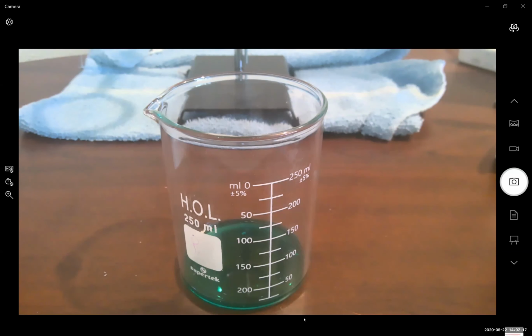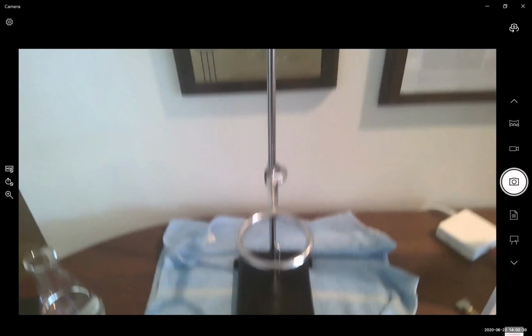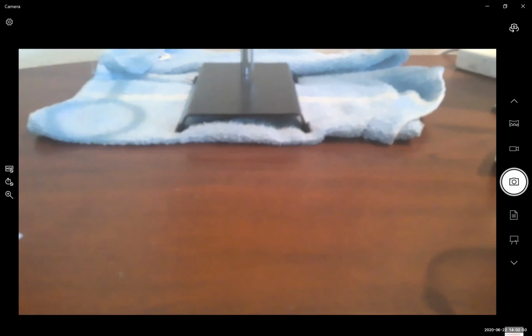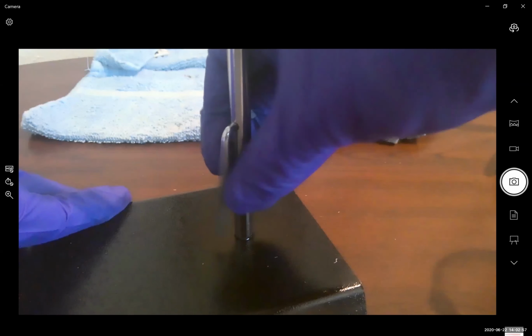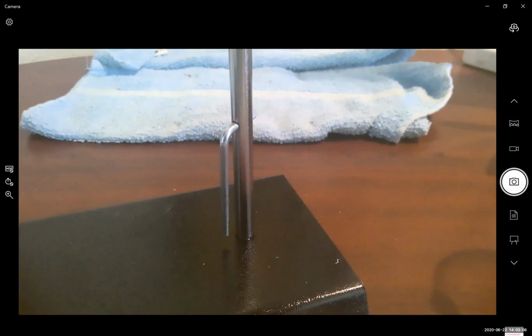Okay, so next you're going to set up your ring stand. To talk a little bit about the ring stand that we're using, it is comprised of three major pieces: the base, the long clamp holder, and then our ring clamp shown here. All of these should be put together from your lab kit, and you want to make sure that this bottom clamp holder is completely twisted to the right and secure. It should not move substantially. It should be very secure, okay? You don't want it moving around when you have liquids on top.